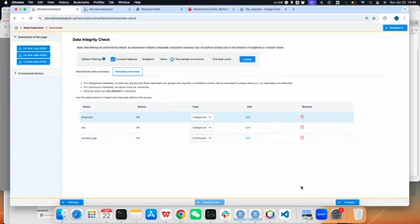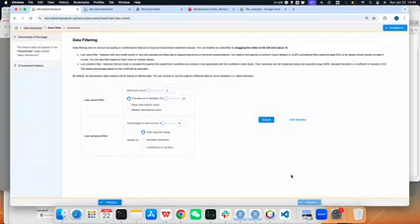So next, everything is all right here. We can then proceed to the next step. Then we go to the data filtering, because in this statistical analysis, we basically need to do the comparison. So we have the primary metadata. We require you to have a category metadata like this diagnosis or treatment.